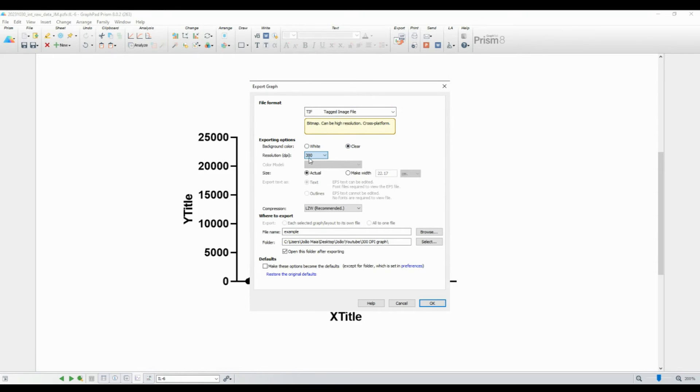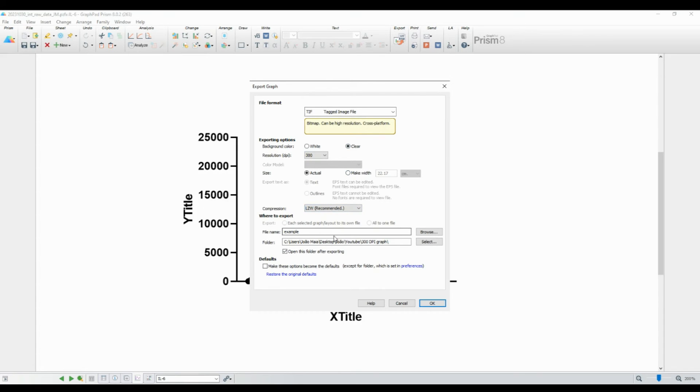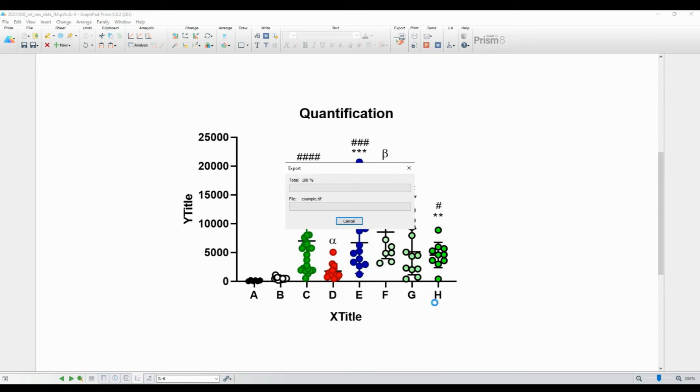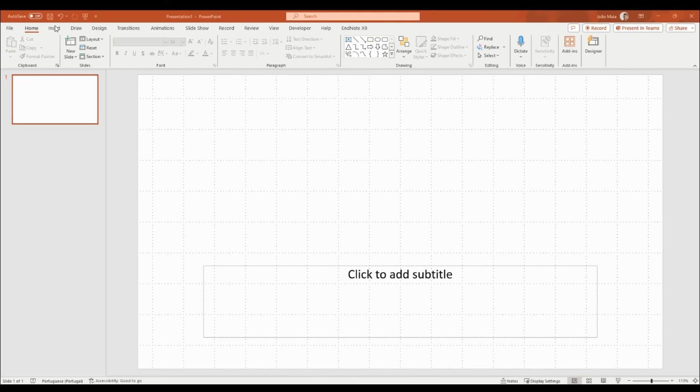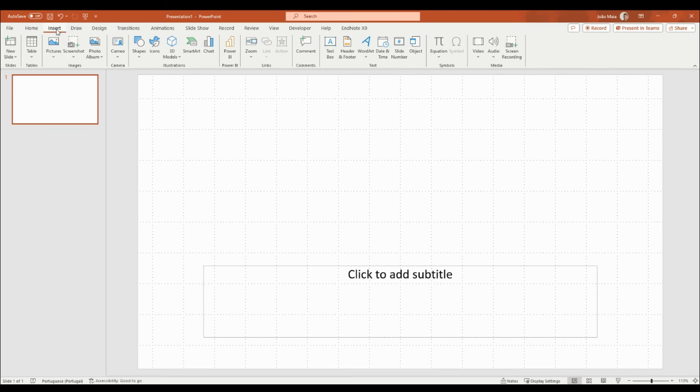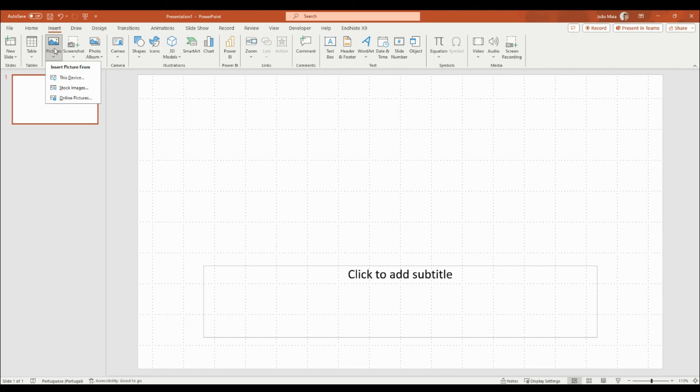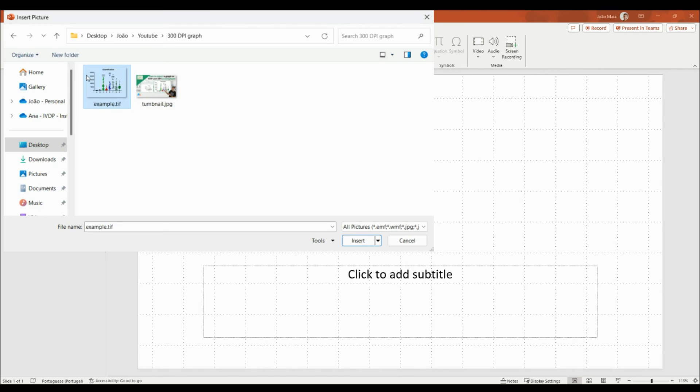Finally, click the Export button and GraphPad Prism will save your graph as a TIF file with a resolution of 300 DPI in the location you specified. And there you have it. You've successfully exported your graph as a high-resolution TIF file with 300 DPI using GraphPad Prism.